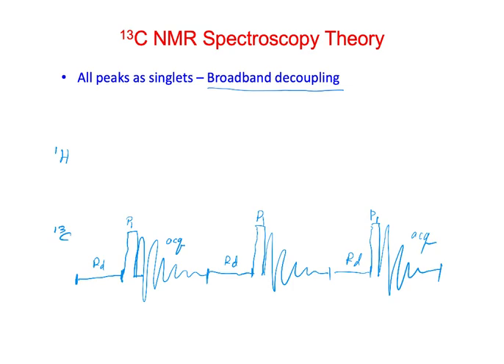Essentially the way we could draw this out is we'd turn the decoupler on the entire time. So it would just be fully decoupling.